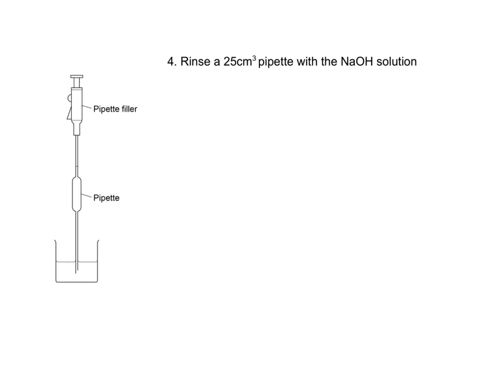Rinse the pipette with a small amount of the sodium hydroxide solution. Then, using pipette filler, you are going to pipette exactly 25 centimetres cubed of the sodium hydroxide solution.